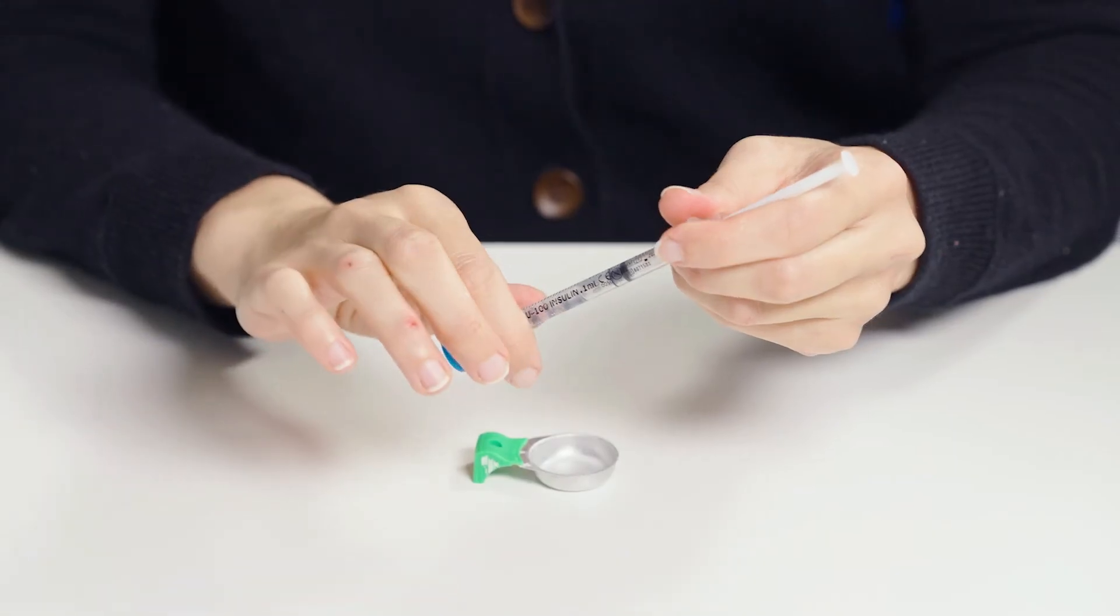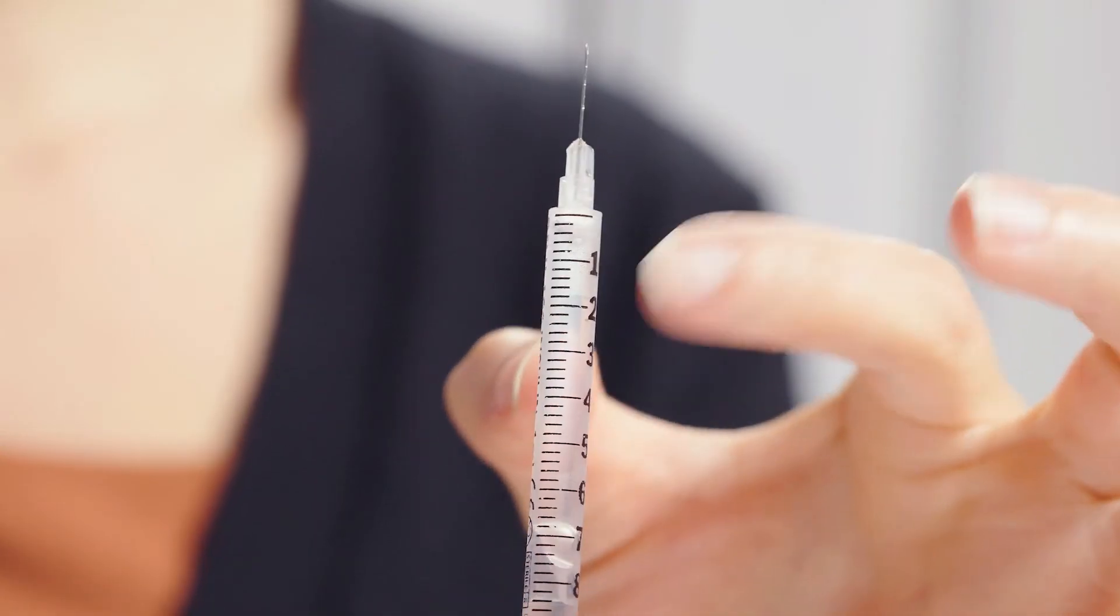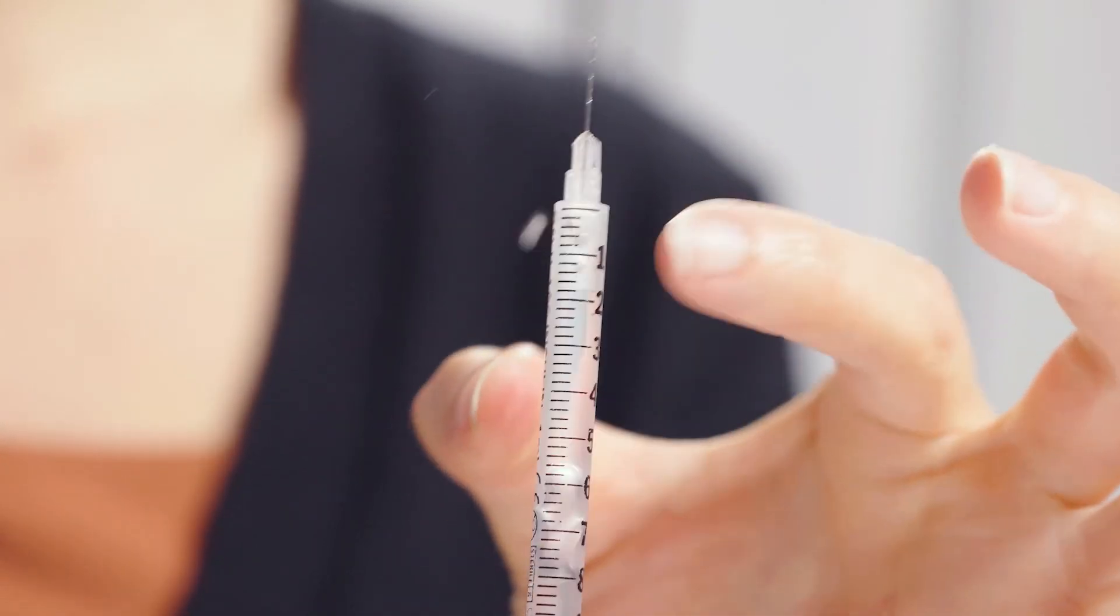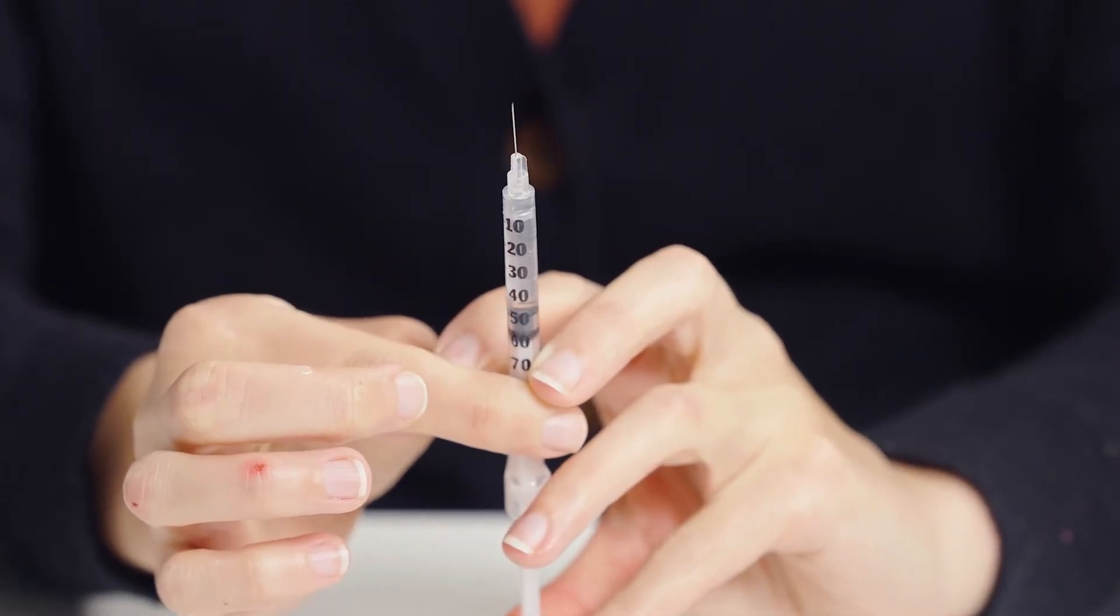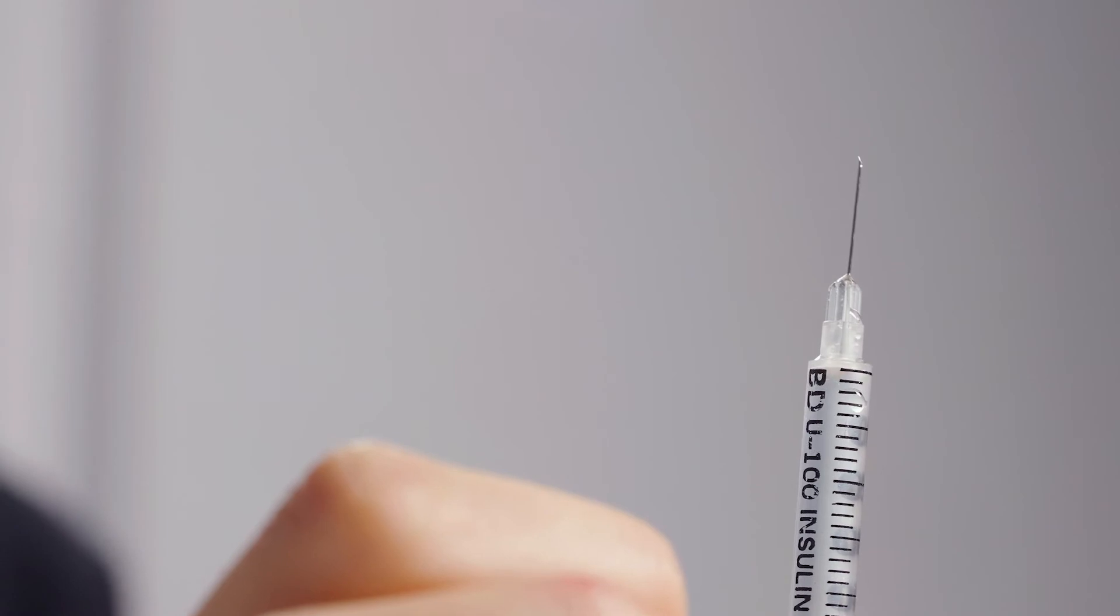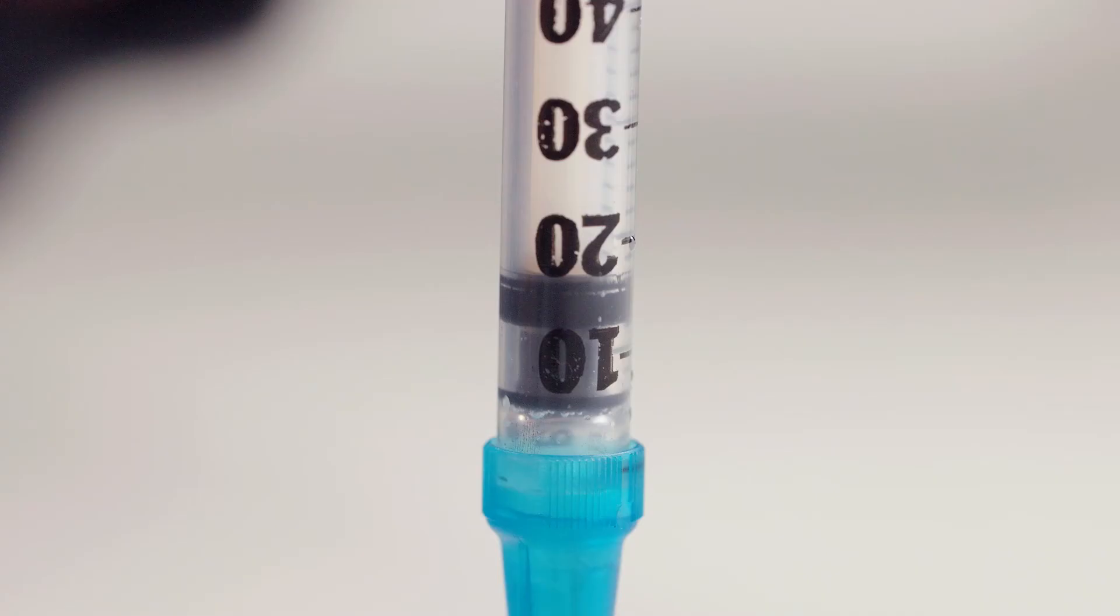The SteriFilt can now be removed and discarded. It is necessary to remove any air bubbles before using the syringe. To do so, hold the syringe vertically with the needle pointing upward, tap on the syringe to make the bubbles rise, and then expel them with the plunger. The filtration process is now complete.